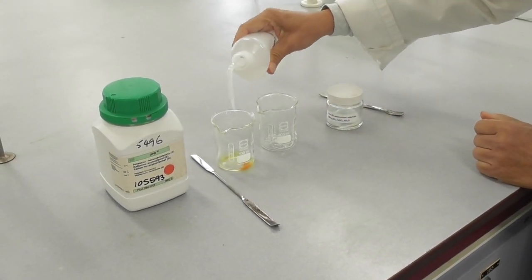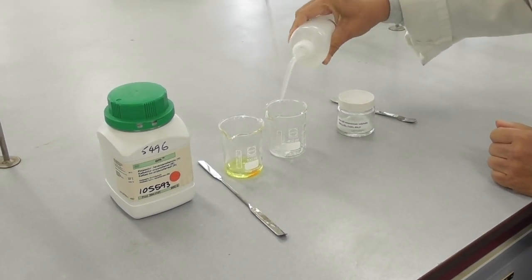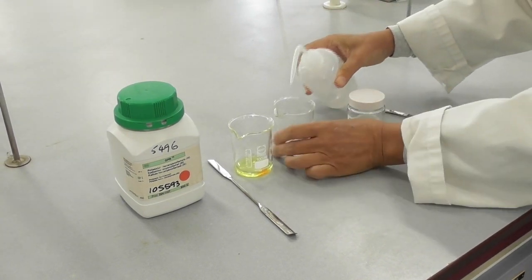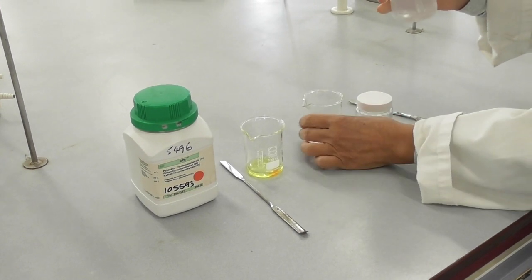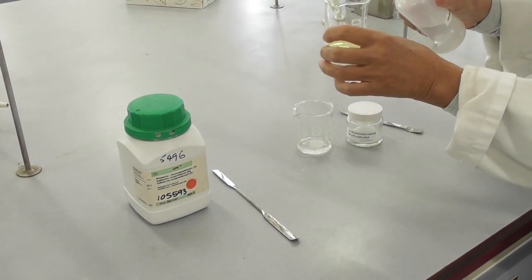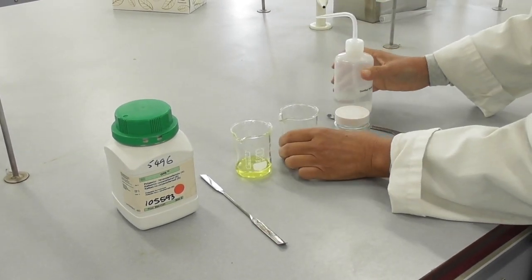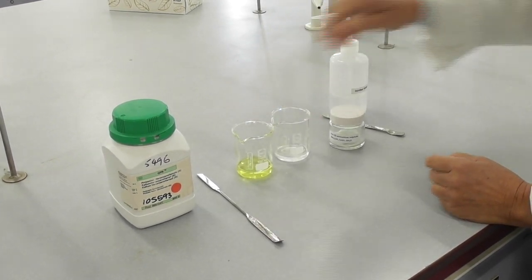I add distilled water into both of the beakers to create dilute solutions. The resulting solutions are faintly colored — one is pale yellow and the other one is very pale green.